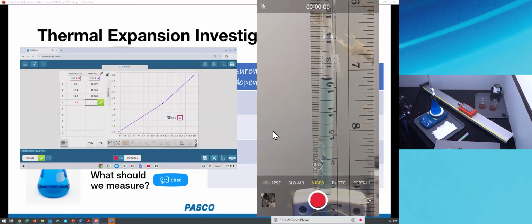Getting close to 12.5. One thing that's important for students to know when they are doing manual sampling is that we're not pressing stop until we've collected all the individual data points that we want. If we press stop, we would only have these data points in the run, since start and stop is collecting data from the beginning to the end of the run.